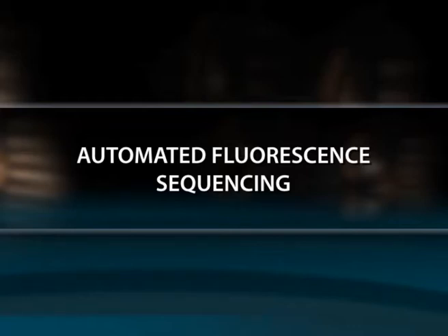Automated fluorescence sequencing. Since the completion of the Human Genome Project, technological improvements and automation have increased speed and lowered cost to the point where individual genes can be sequenced routinely and well over 100,000 billion bases can be sequenced per year, or an entire genome can be sequenced.